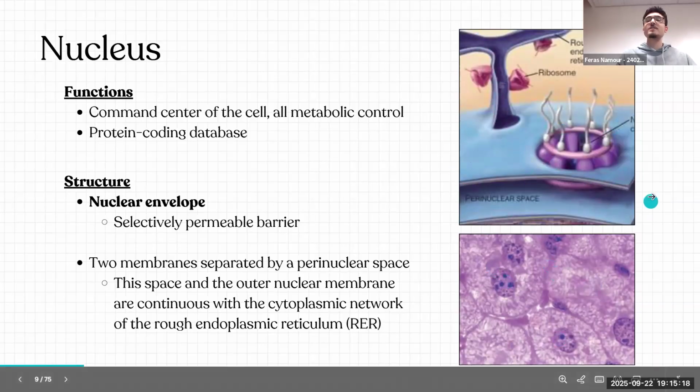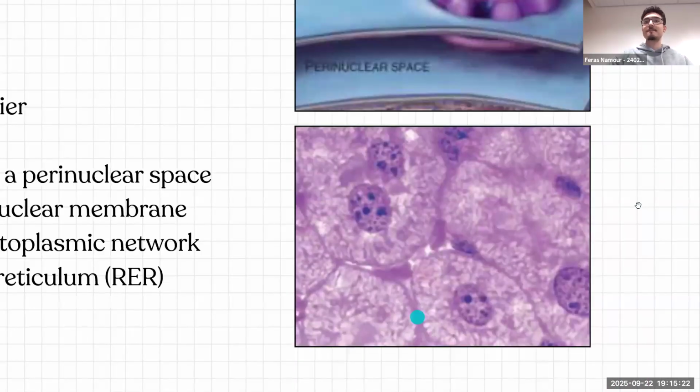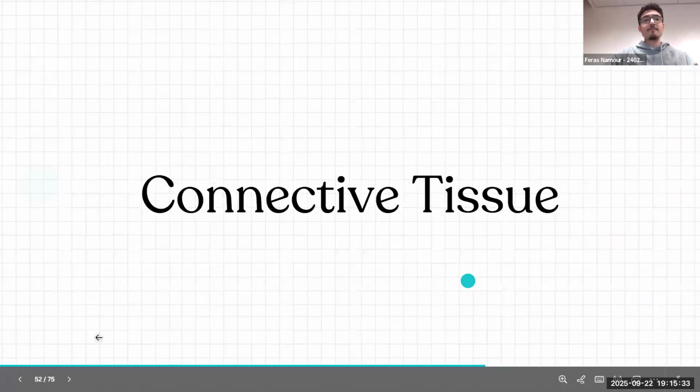But over here, this is your first ever histology slide, and this is how cells look. So basically, you can see borders here. You can see a circle, and then inside it is a smaller circle. Now, this larger border over here, sorry.